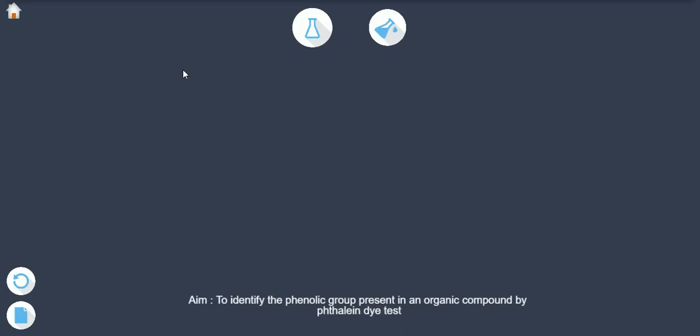Aim: To identify the phenolic group present in an organic compound by phthalein dye test.